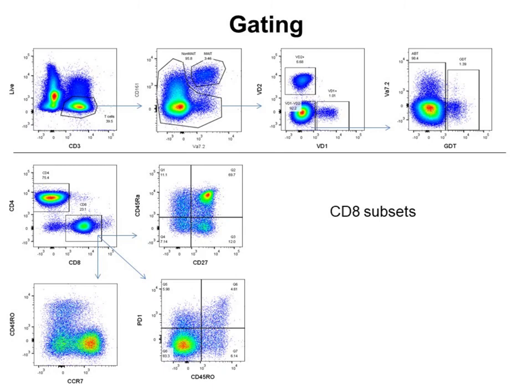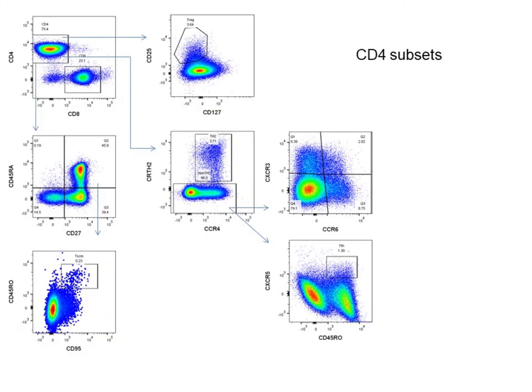Here I show you the CD8 cells, and in this slide I show you how the CD4 subsets look like and the different populations of T helper cells. You see the Th2 with the CrTH2, for example, staining here in the middle of the slide. This is a marker, CrTH2, we added as an additional marker.